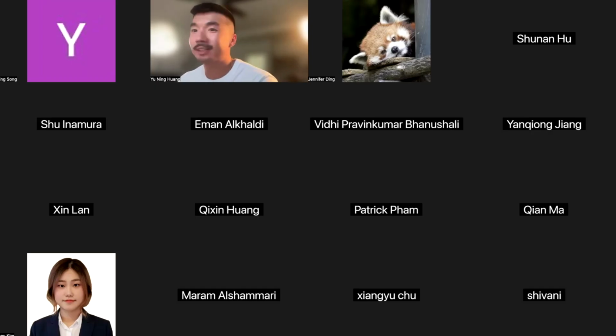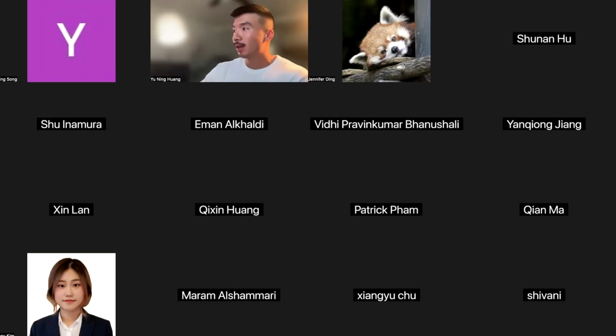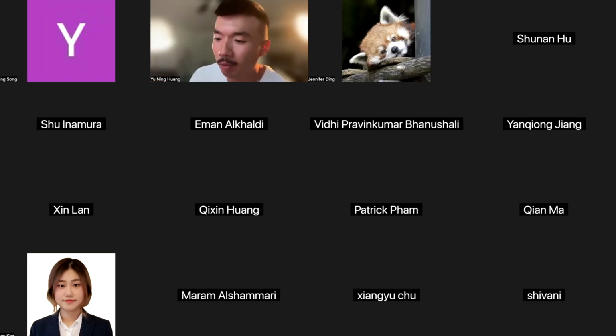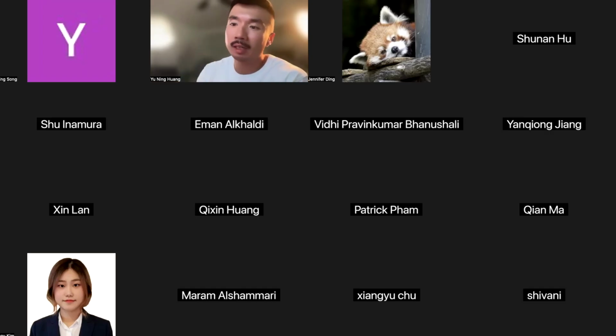So today's lecture will be talking about the single cell RNA-seq workshop. Basically, we'll just run through a quick quality control that we brought up last week. We need to make sure there's good enough quality of cells, and that every cell has enough genes.